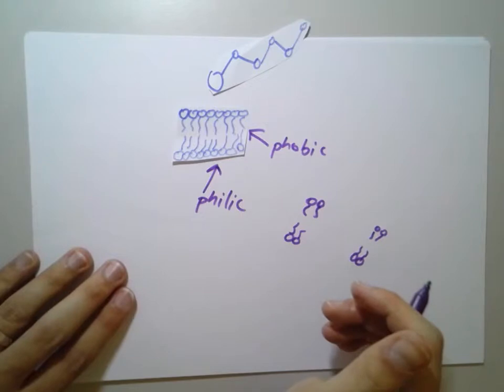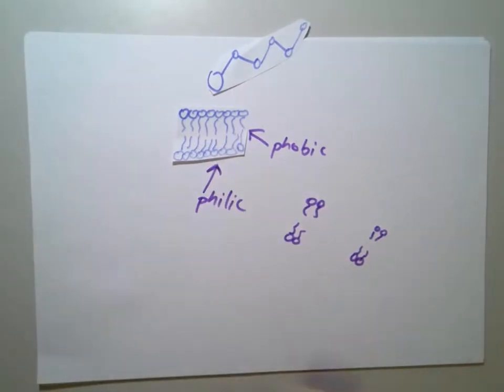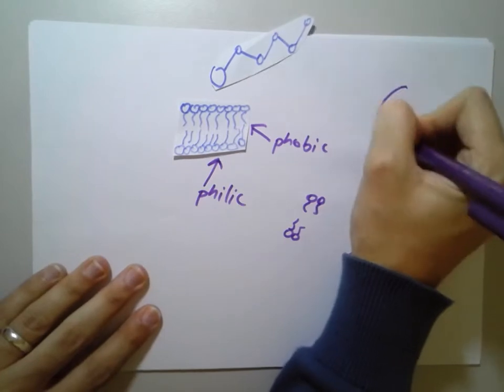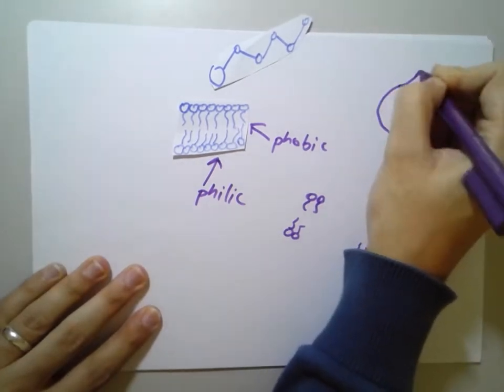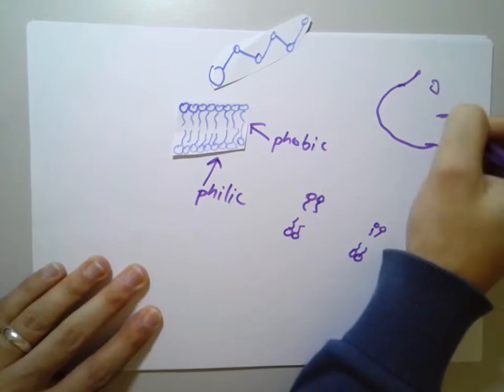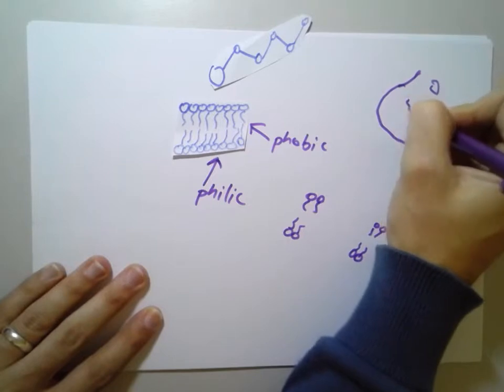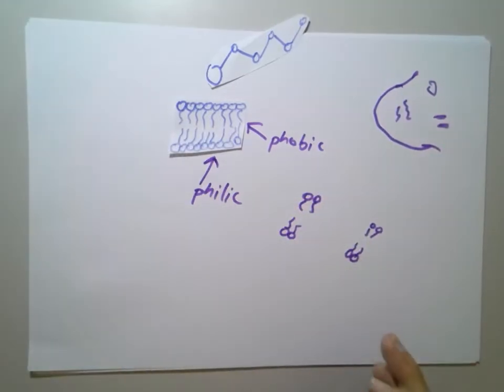So once this has happened, all the organelles have burst out. If this is a cell, the cell has burst out like this. You have the nucleus, the ribosomes, the fluids in the solution, the reticulum, all just going out into our solution. Okay.